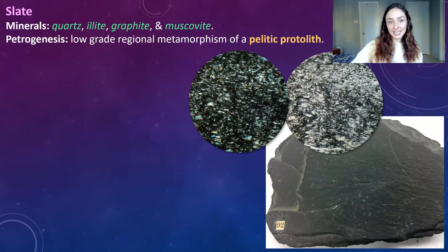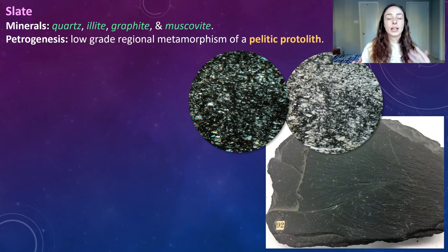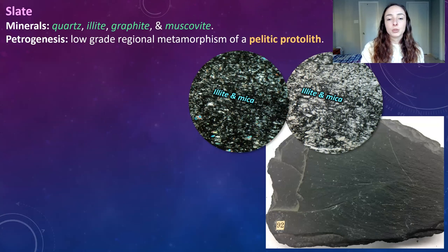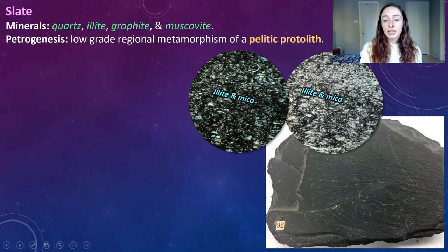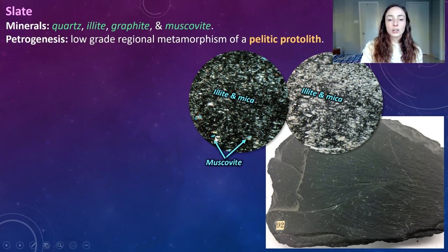Now we're moving on to slate. Slate is the metamorphic equivalent of a pelitic protolith — meaning like a muddy or clay-rich protolith like shale. It is the low-grade metamorphic equivalent, whereas the high-grade equivalent of shale would be either a phyllite or a schist. Slate includes minerals like illite and mica. In this mineral we can see it's mostly illite — a clay mineral that has not fully altered to muscovite yet. The thin section is dominated by platy fine-grained illite and some quartz. There are also some lighter platy minerals with interference colors indicative of minor muscovite.